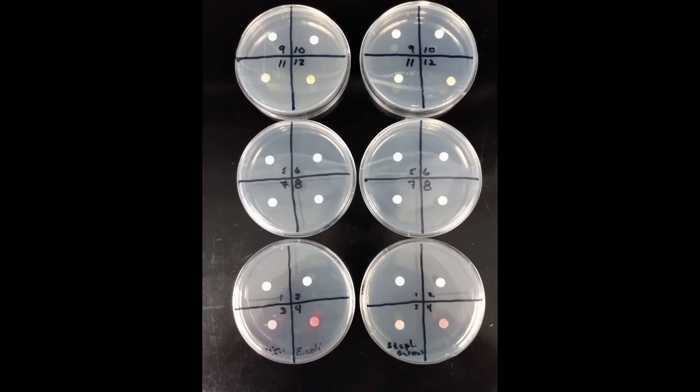Here we see what the 6 plates look like after I am finished. You can see on the left, the 3 E. coli plates have the 12 chemical antimicrobials placed in the appropriate quadrants, and the 3 plates on the right, which are Staph aureus plates, also have the same 12 chemical antimicrobials placed into the appropriate quadrants.